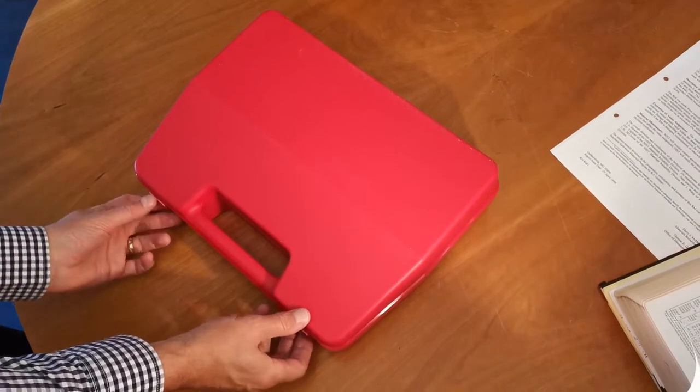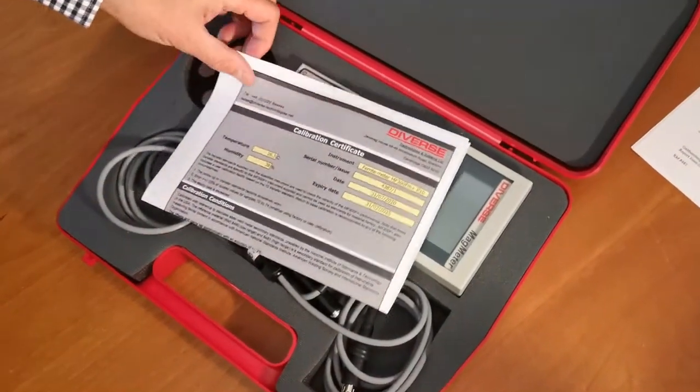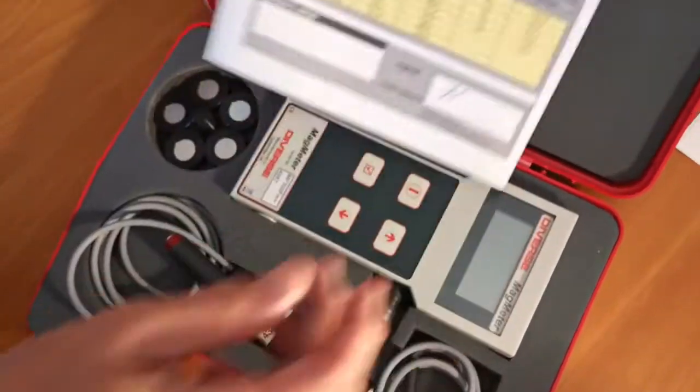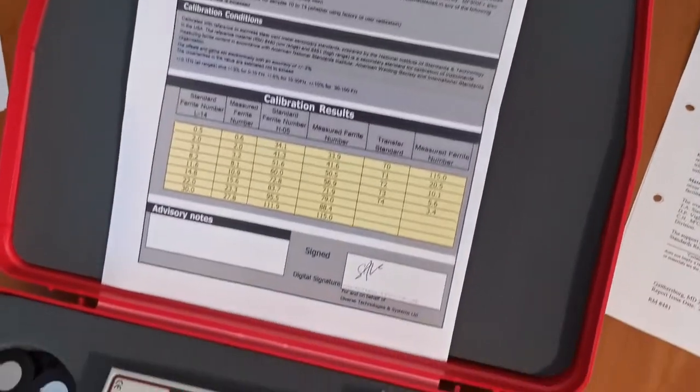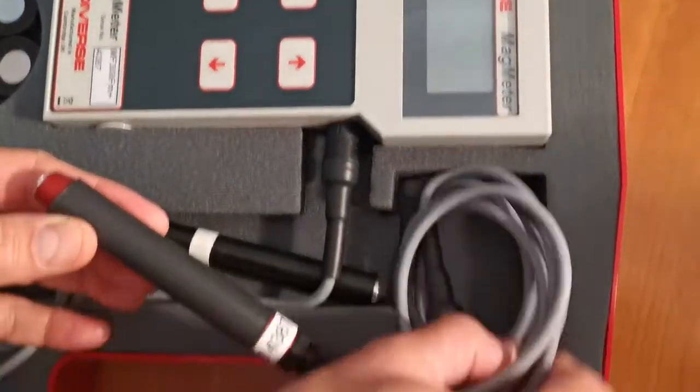The Diverse Ferrite Meter MF300FM Plus is the latest version of the popular Diverse Ferrite Meter, supporting up to 5 probes. The instrument will measure ferrite number from 0.1 to 115, equivalent to 0.1% to 80% ferrite.